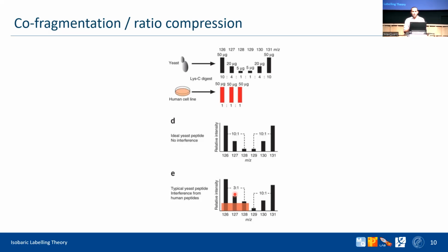Having a very good performing liquid chromatography would help with this. So you would have better separation. So the more care you put into your LC system, the less you will have problems. The narrower your isolation window, the better. And of course, if you have good software that can take care of this, you should also be okay.